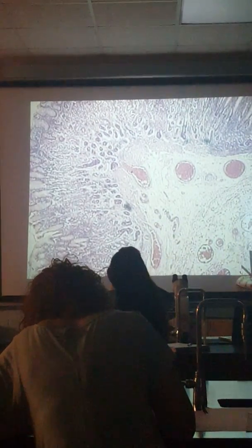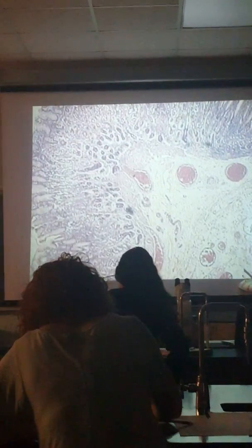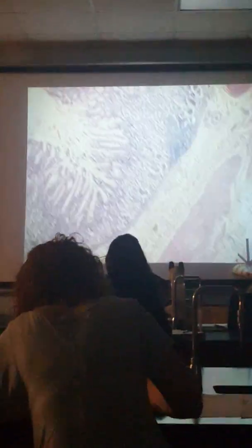Now, as we get down into the stomach, you'll see there are a lot more folds, and it's not as linear. So what are these really big bumps we're looking at? The folds in the stomach are called rugae. You can see all these lumps and folds, these rugae. So it's kind of contorted.